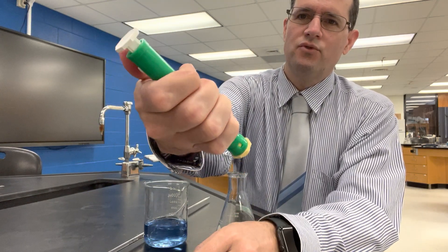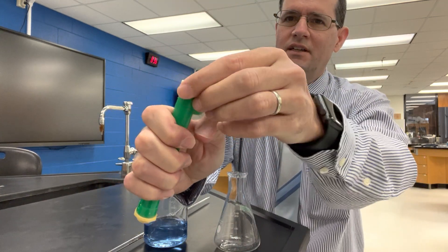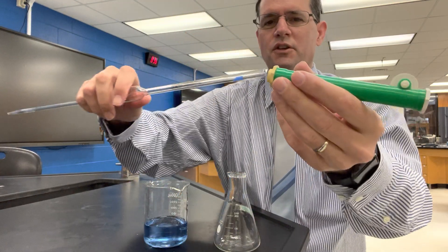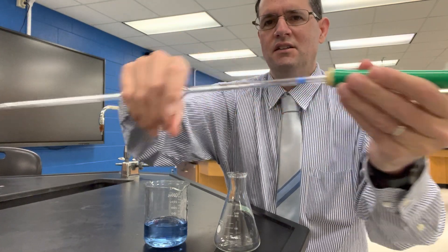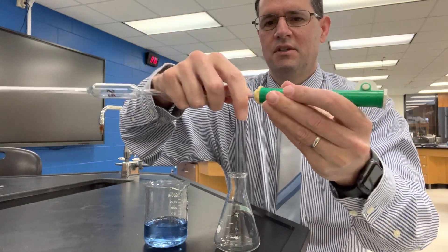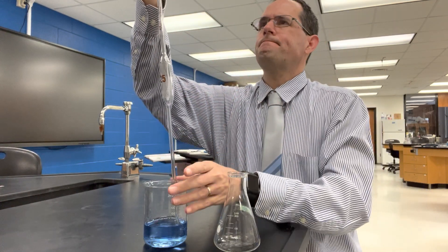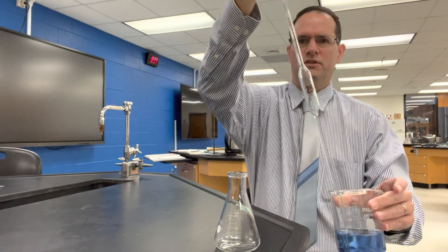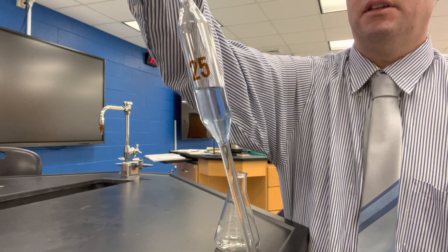This is a pipette pump — you roll back on this little wheel and it pulls the plunger up, and you can also manually do that. Place the end of the pipette firmly into the device. Don't push near the tip because you could break it and cause an injury. Hold it up near the tip, firmly press it into the rubber, then pull on the wheel and you'll see the liquid slowly coming up the pipette.